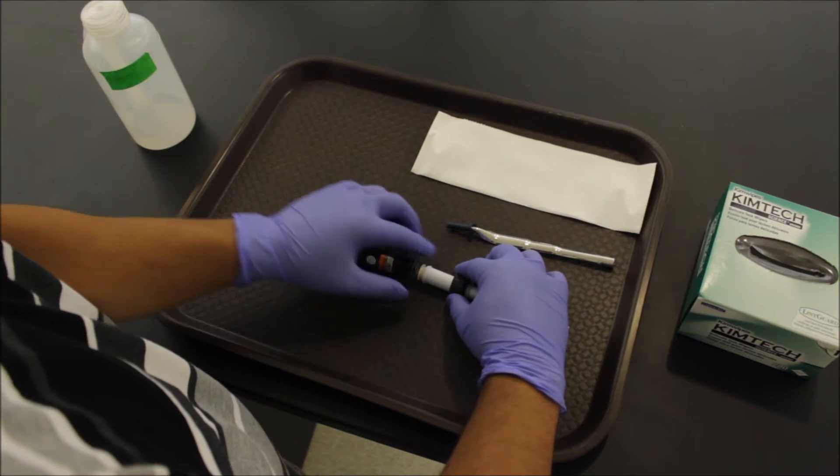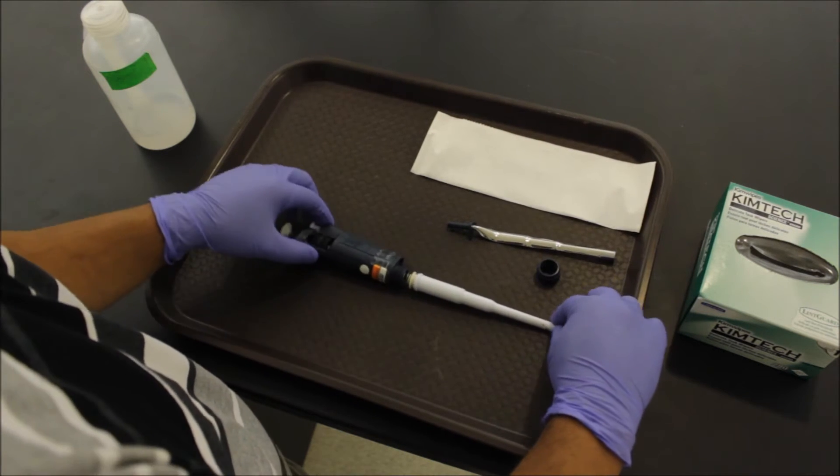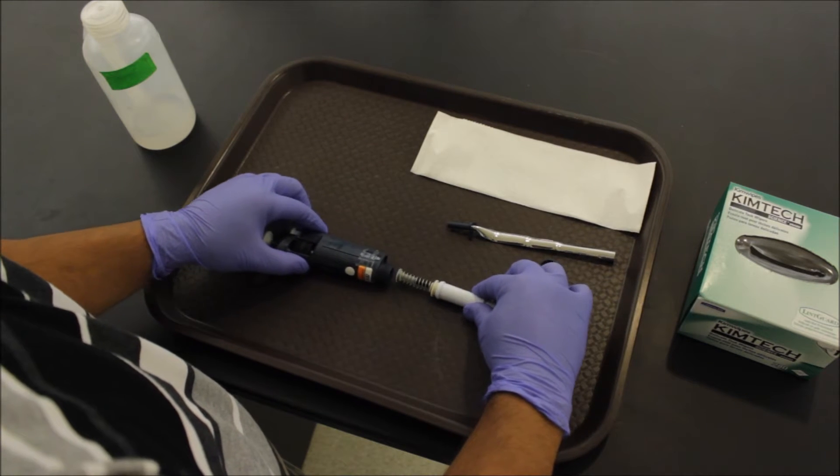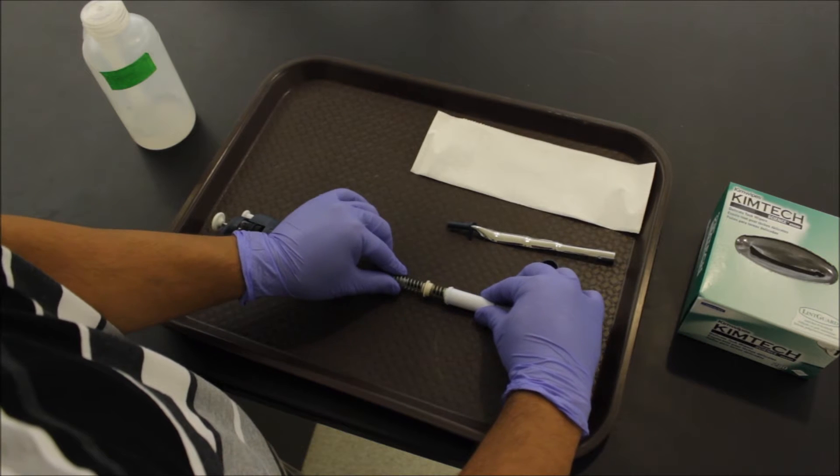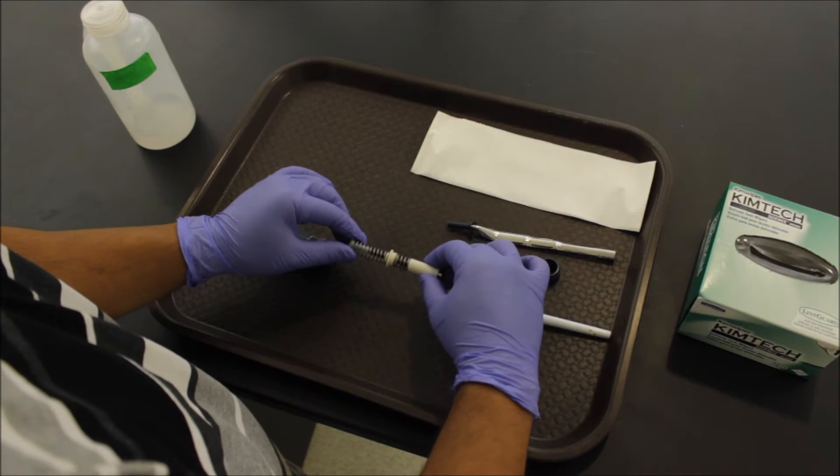Slowly take the nut off. Then remove the barrel. Take out the spring assembly and watch for an O-ring in smaller pipettes.